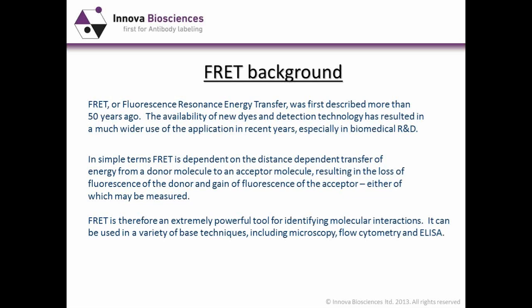So a little bit about the background of FRET to start with. FRET stands for Fluorescence Resonance Energy Transfer, and it was actually described more than 50 years ago. I think it's fair to say that over the last 10 to 20 years, the availability of new dyes and also of hardware in the form of detection technology has resulted in a much wider use of the application, especially in biomedical research and development.